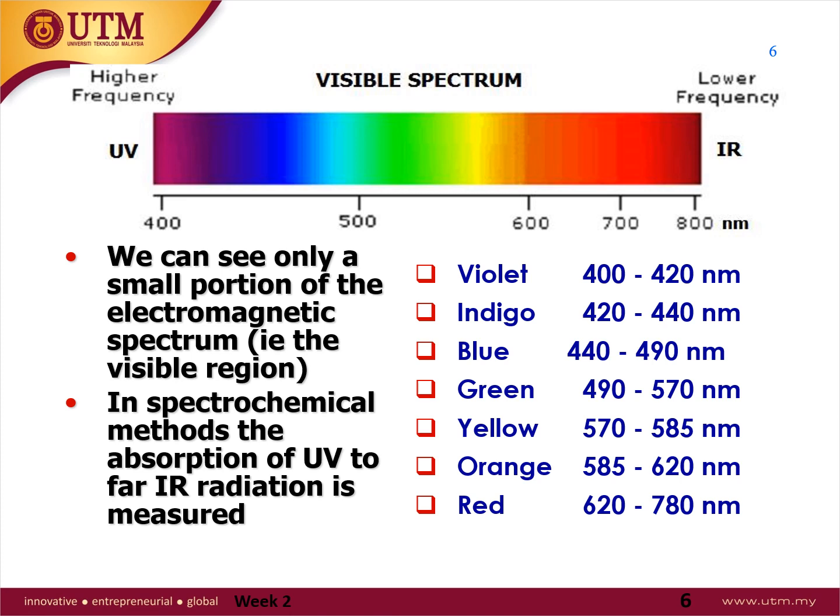Absorbance: when the sample absorbs the radiation, in this case it absorbs orange and yellow, it will transmit whatever is left. Remember my statement before, whatever is left. So in this case it will transmit green. That's why our eye can see a green solution inside this video. The same thing applies in other chemical solutions.